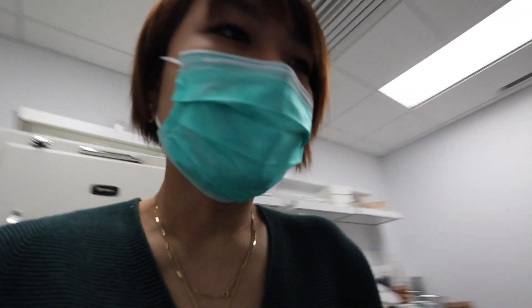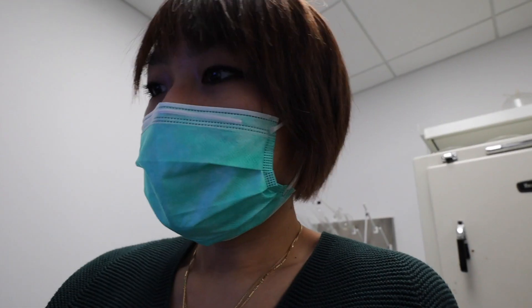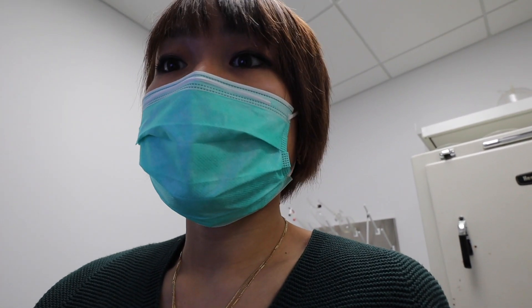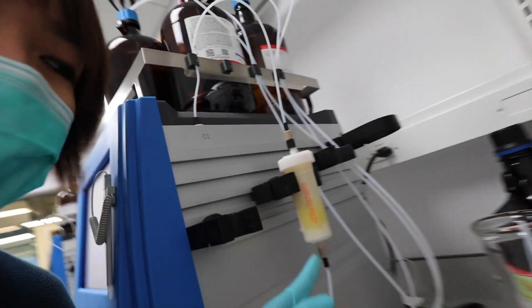Okay, never mind, I think that might actually be my compound because I checked the TLC and it looks like it matches my product. Okay, I'm gonna concentrate these. Actually I'm gonna check TLC again for all of these fractions and then I'll concentrate it I guess. But I think the free drug is still here, so I'm gonna run just all of the solvent out.